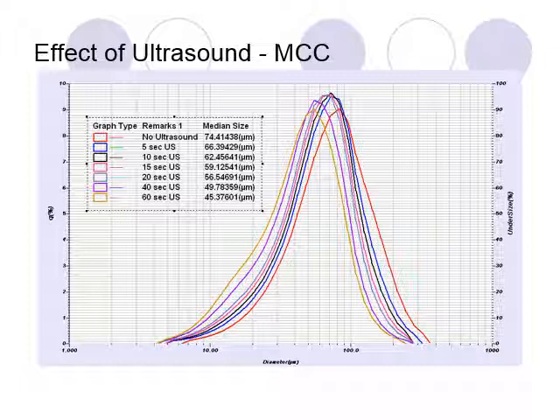Obviously, it's starting out large, and then the ultrasonic breaks it down. But you need to have enough breakdown to be confident that it's done. How do you know at that 60 seconds it's finished? Because every time increment that you're showing here, it was still getting finer. I would have moved this to a higher level ultrasound and a longer duration, or I might have to change the surfactant to make sure that I'm getting it broken down, because this is what it would mean when I'm not getting stability out of my system.